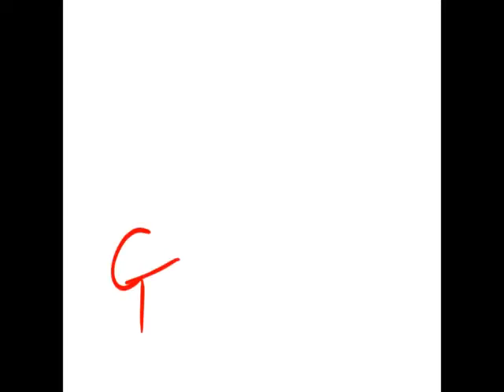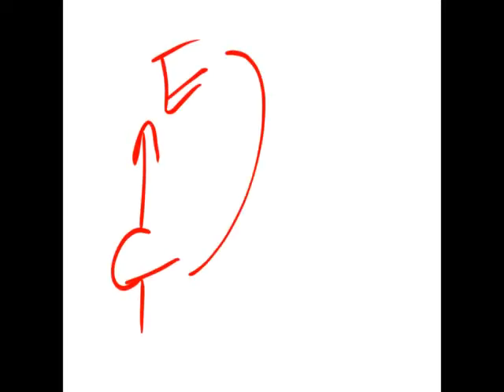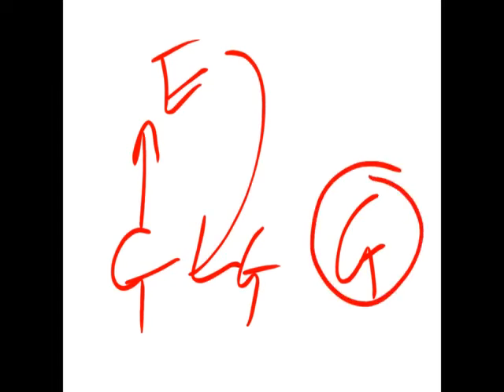So if an element goes from ground state to the excited state, and again comes to the ground state, then it emits the energy. If we measure that energy, it is the principle of flame photometry. But some of the elements, instead of converting from ground state to excited state, remain in the ground state. They will absorb the radiations, and the measurement of that absorbed radiation is the principle of atomic absorption spectroscopy. I think you are clear with the difference between flame photometry and atomic absorption spectroscopy.